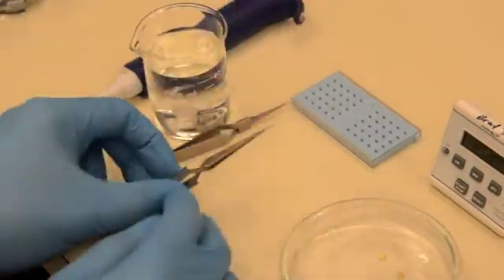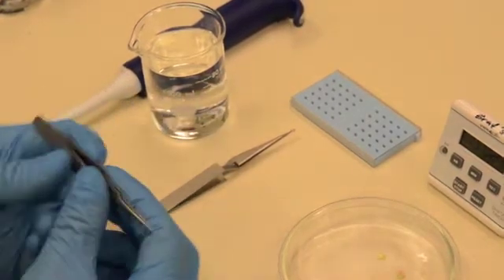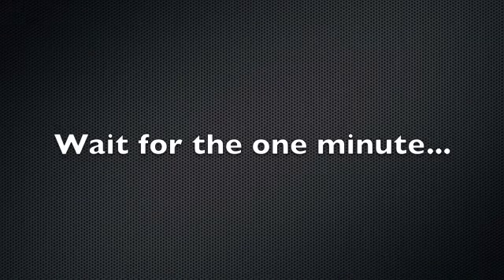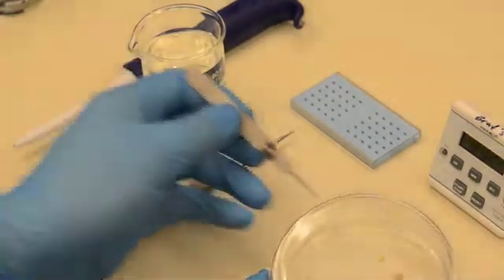Place the grid aside. At the 1 minute mark, wash the second grid in the same beaker of water using the same technique.